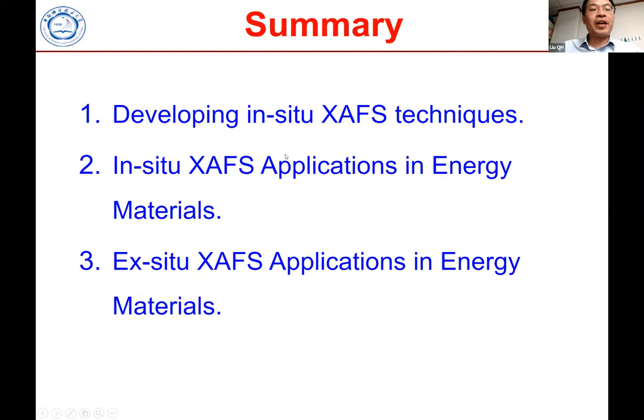Okay, in summary, we have developed the in-situ XAFS techniques, and the in-situ XAFS are used to investigate the structure dynamics of active sites for advanced energy materials. Furthermore, XAFS are used to reveal the structure-activity relationships for a lot of low-dimensional nanostructured energy materials.